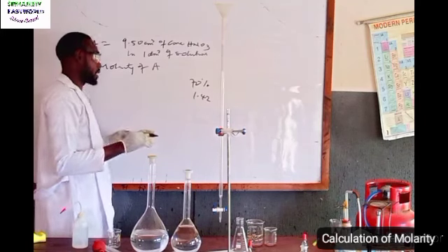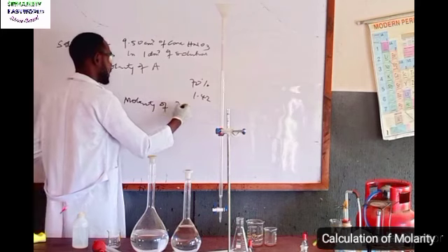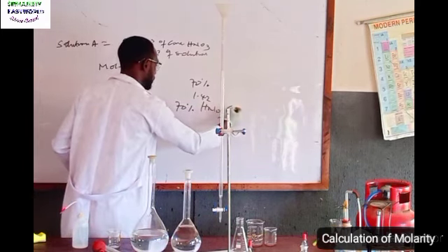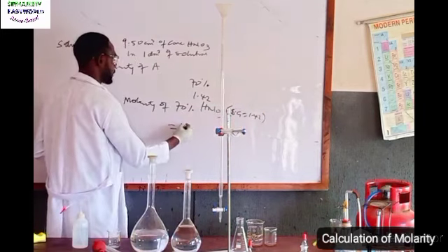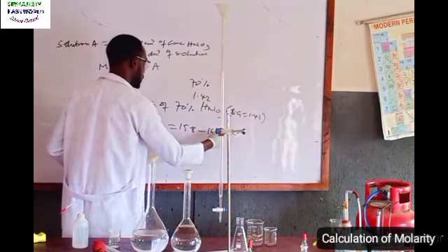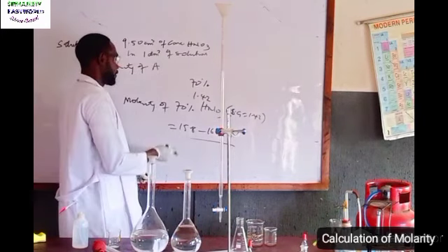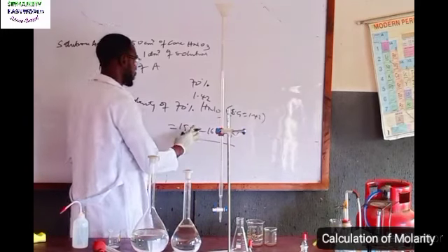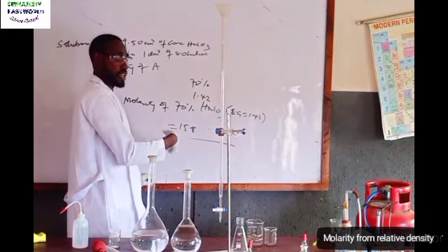From my standardization and analysis, it is automatically confirmed that the molarity of 70% HNO3, which usually has a specific gravity of 1.42, is usually 15.8 mole to 16 mole, 16.0 mole per dm3. That is within this range, 15.8 to 16.0 mole per dm3. So in this calculation, I'm going to use 15.8. I've realized this from several standardizations I've been doing.